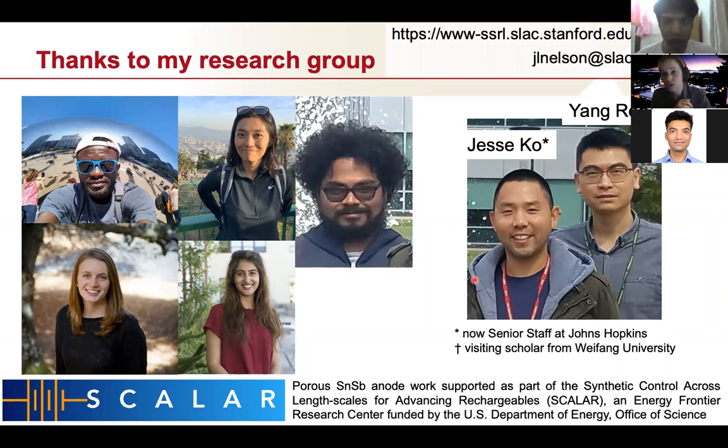So we're exploring zinc stripping and plating. SEI is also very difficult to probe with X-rays. It's all low Z materials. It's also very radiation sensitive sometimes if you're looking at it with the electrolyte around. There's been some really good work on soft X-ray spectroscopy of SEI growth on, I think, copper originally, but I think they're working towards doing it on lithium as well.